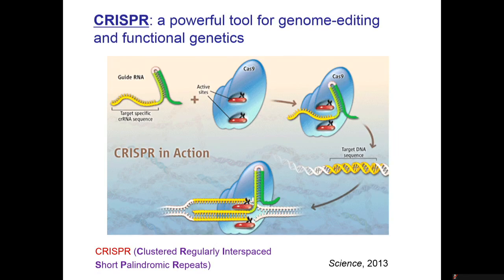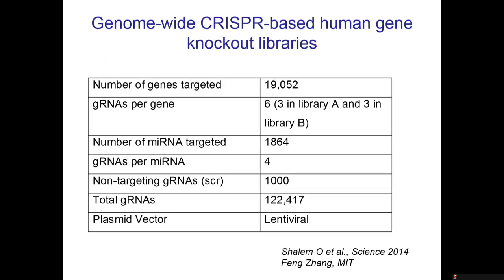So using this approach, here I don't have to go through these. People have given a very nice introduction to CRISPR. So here is a library we use also. Chris's lab uses this Gecko library from Feng Zhang's lab. Here I want to emphasize one thing. This was published in 2014, and right after the publication of their paper, they deposited the whole library at Addgene for a fraction of the cost. So basically, you can buy the whole library for $650. That's not a lot of money.